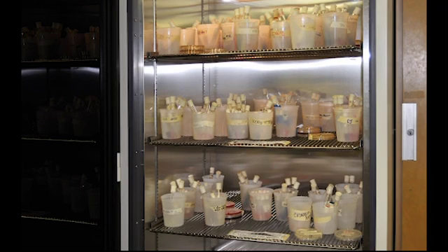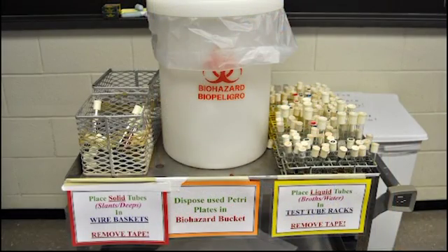Never remove specimens from the lab under any circumstances. All tube media used in the lab must be carried in the provided test tube rack or incubation cup. Do not carry or lift test tubes by their caps, since they could fall and spill and possibly break. Rule number 10. This rule requires you to properly discard all material used in the laboratory.